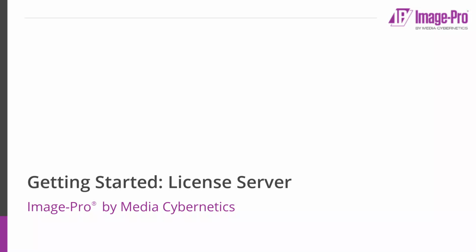In this video, I'm going to describe how to install, configure, and link license bundles to the license server. Let's start by discussing the license server setup. Two prerequisites are required by the license server.